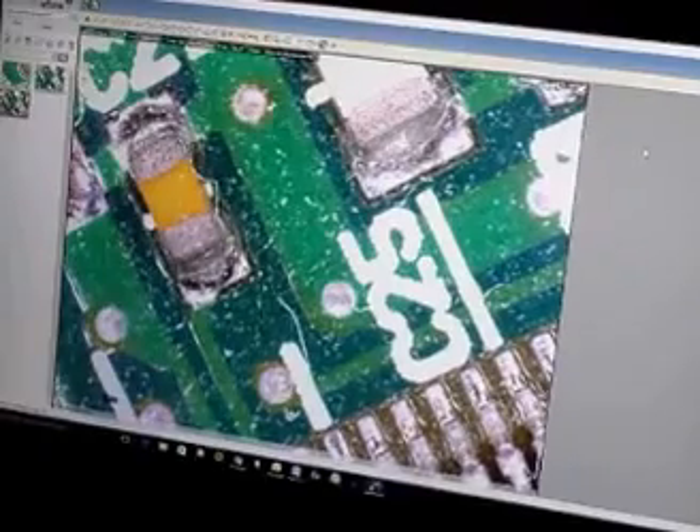Let me show you something else — I'm going to rotate the polarizer. It does make a little bit of a difference; some things it will make more of a difference. Down in the very lower left of the image you can see the copper — this is a clad coin, copper clad by other metals on the outside. You can actually see the copper sticking out, which I guarantee you I can't see with the naked eye.